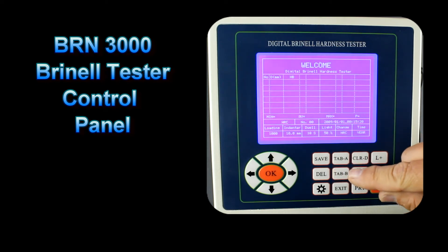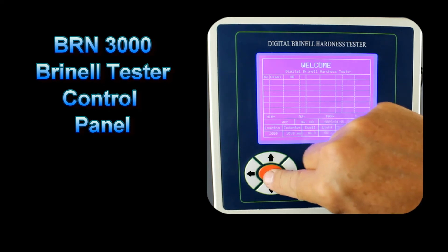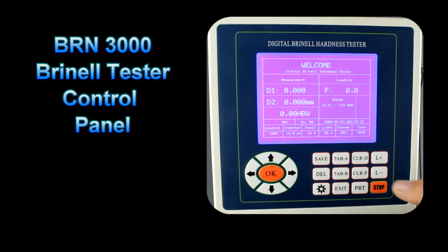We can also print the results. If we have a final result to print, we press the PRT key. Before we exit or turn off the system, we want to make sure we press the exit button — this will close down the CPU. Then we can go ahead and shut the power off.